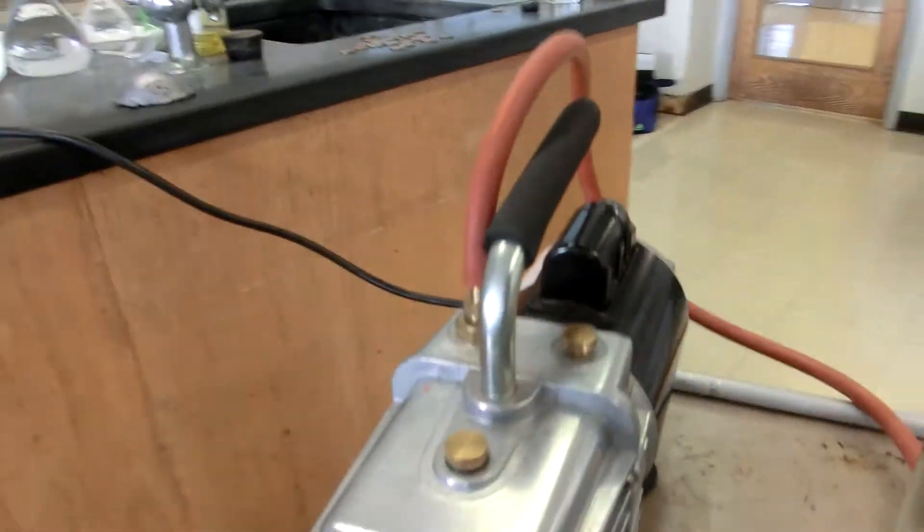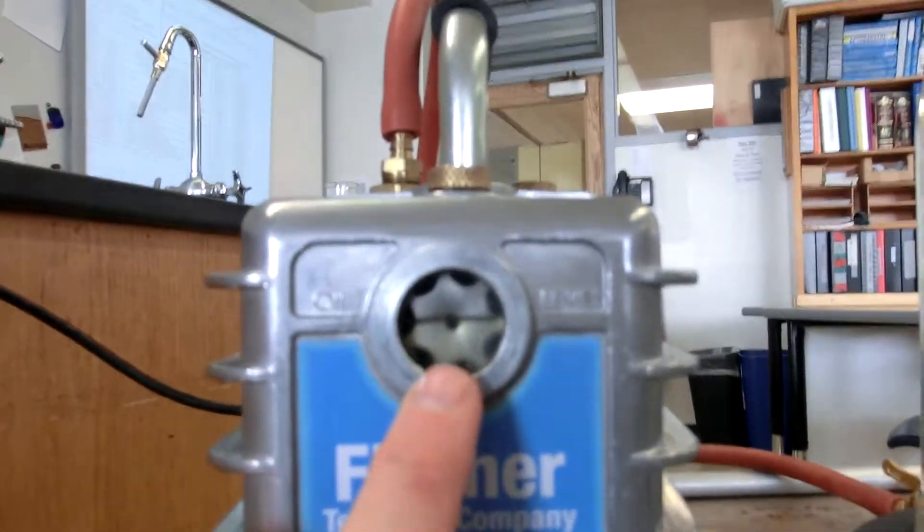On the vacuum pump you'll notice that on the back is the on and off switch. And on the other side right here is going to be the oil level.